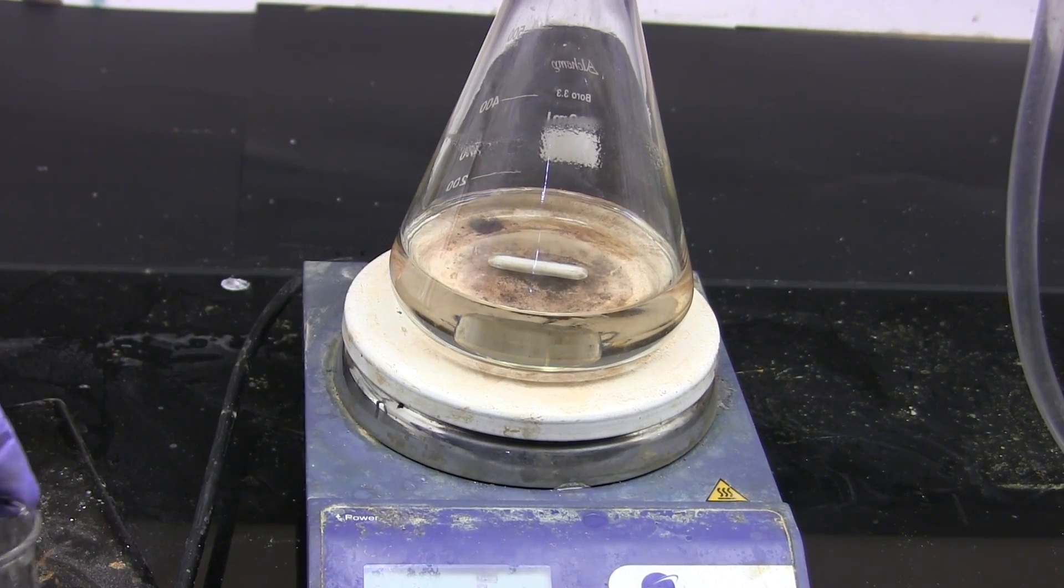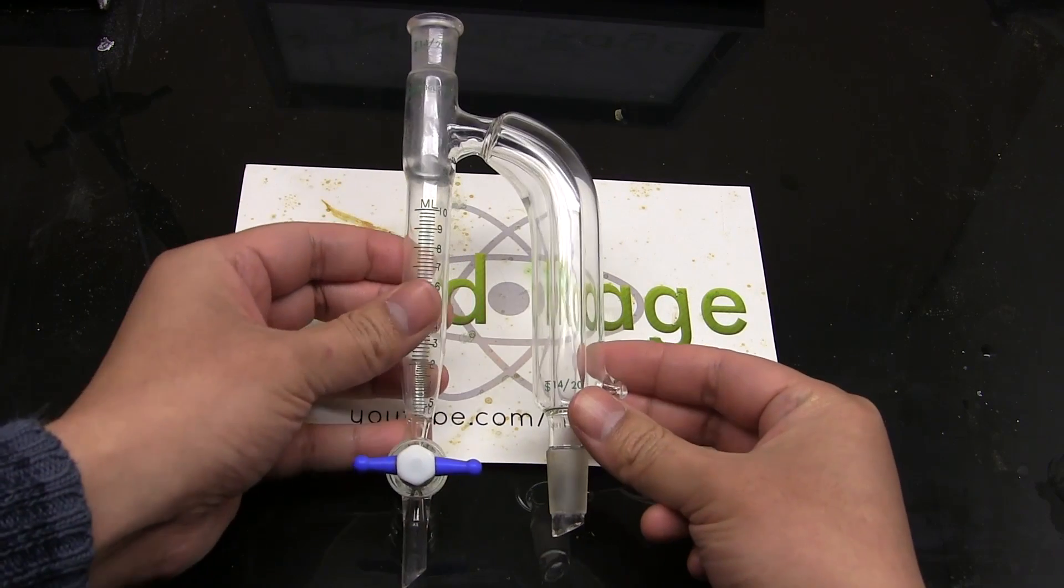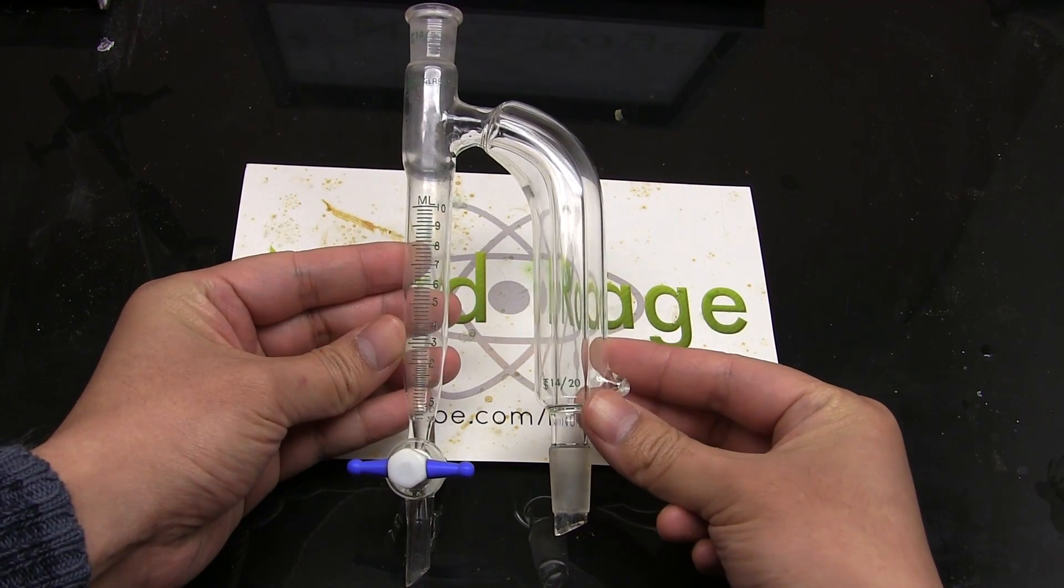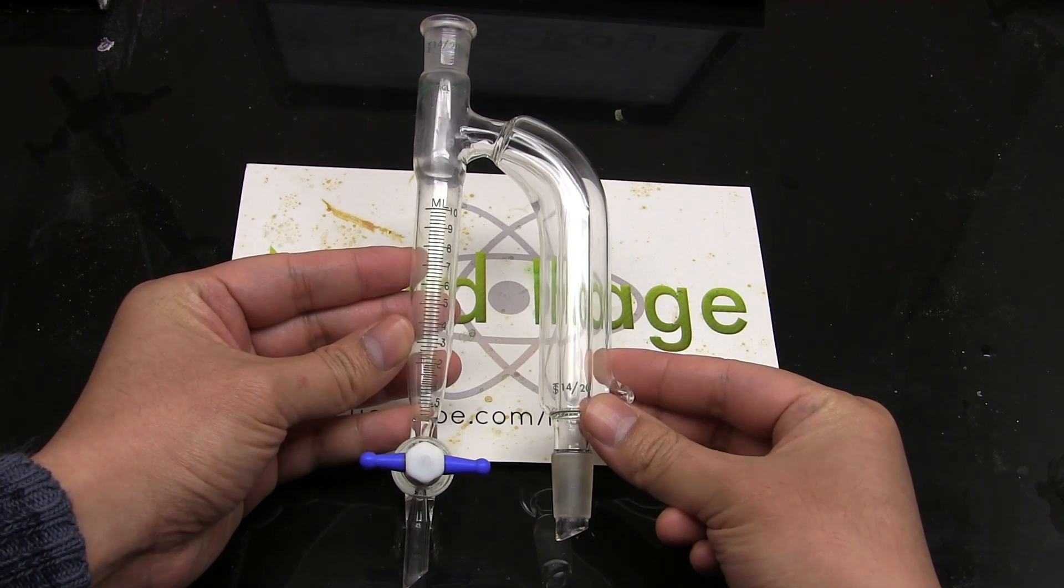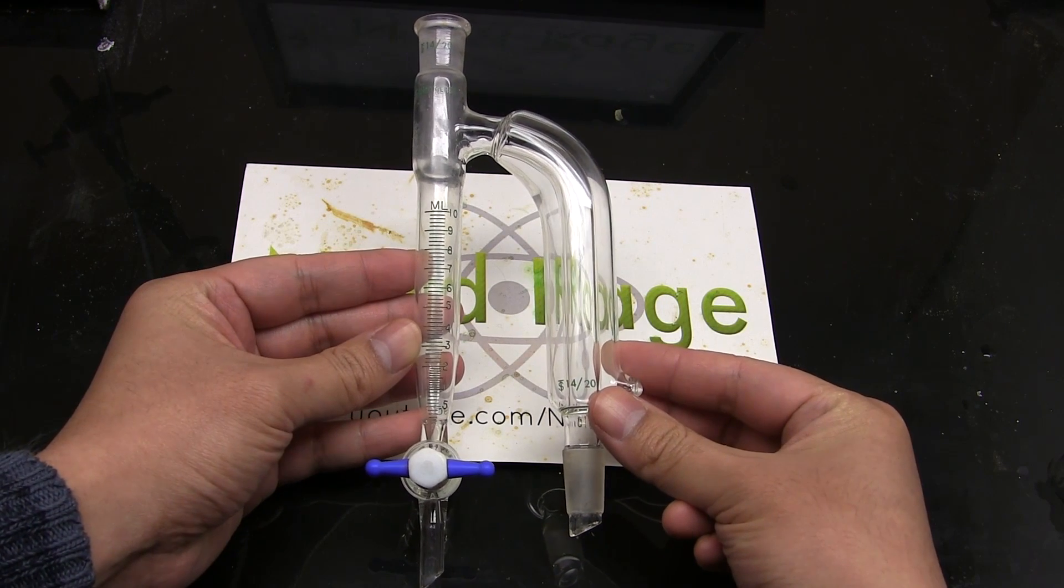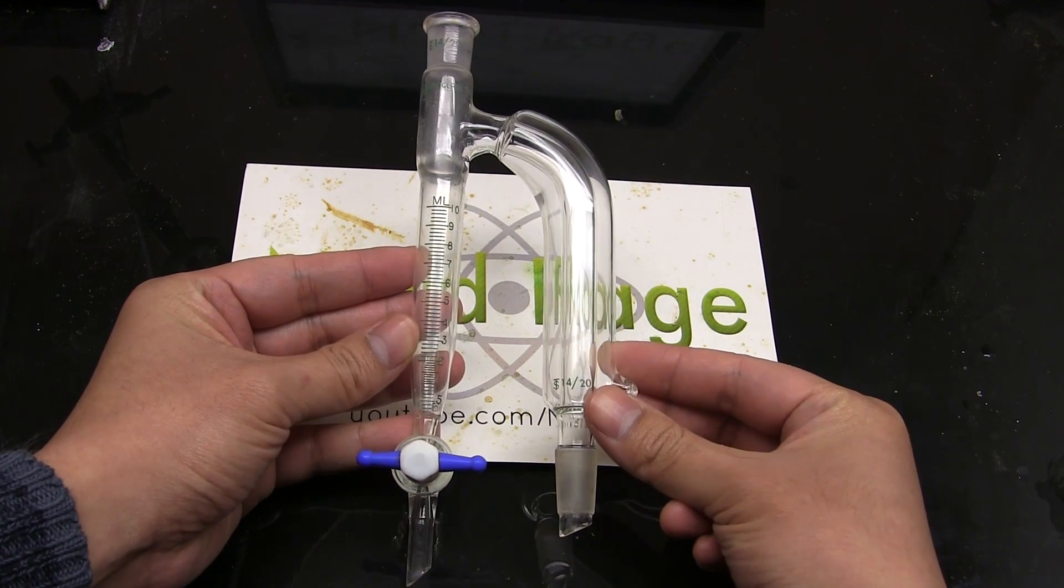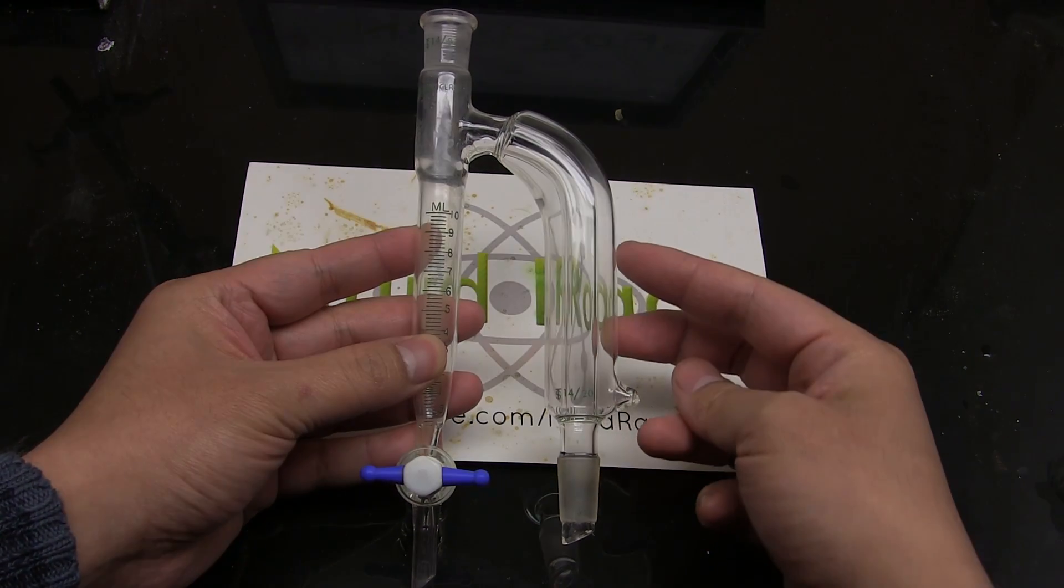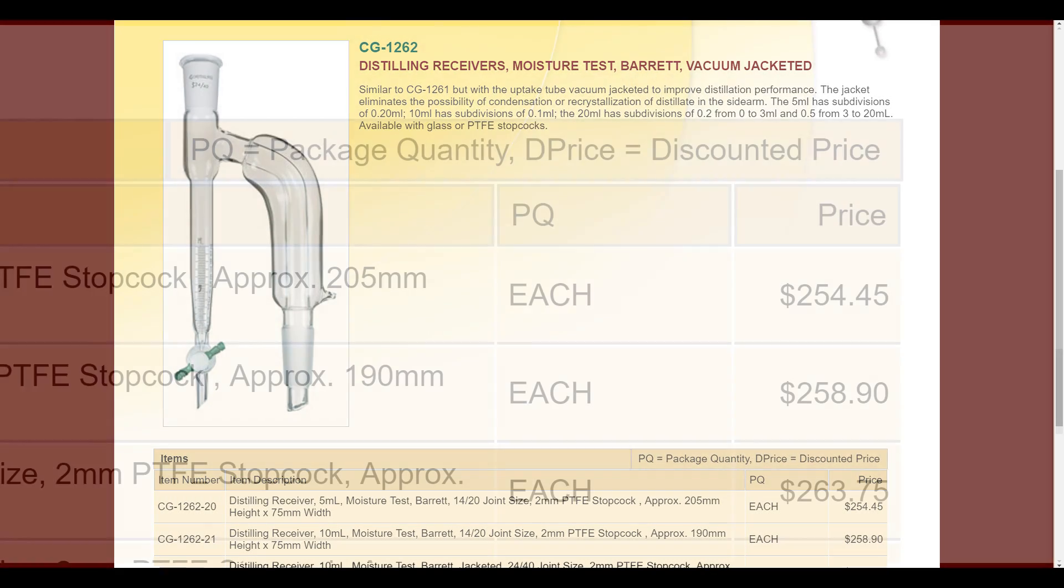Now I've seen Dean-Stark traps cost anywhere from twenty dollars to several hundred dollars depending on the size, the quality and extra features like vacuum jackets or the ability to return the heavier phase rather than the lighter phase. So you'll have to select the one that suits your needs. This one here was generously donated to me but if I had to purchase this exact model it would have cost me around 250 dollars from the original manufacturer.